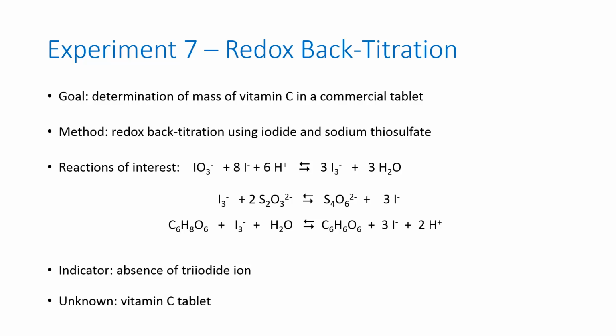The unknown that you're going to get is a commercial vitamin C tablet. You don't have to dry it, but you do have to crush it up and dissolve it in water.